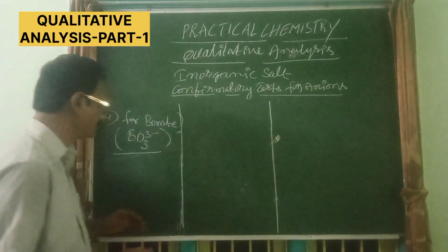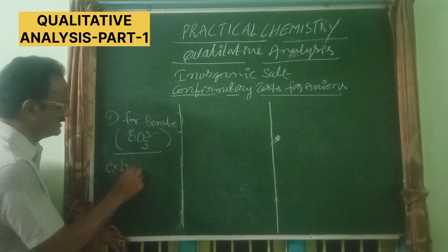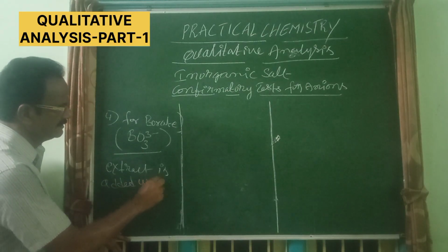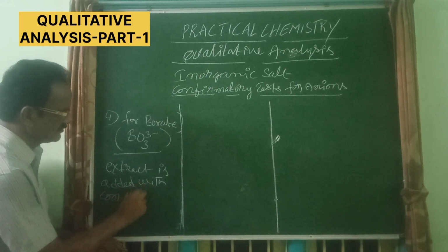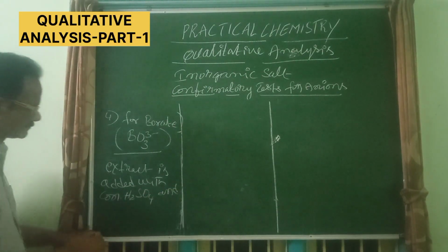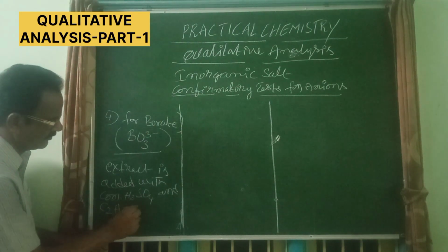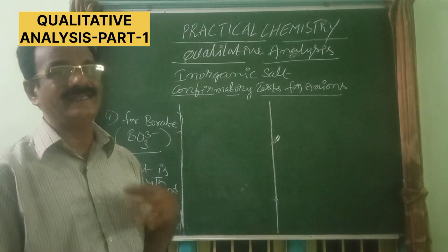Let us see. Extract is added with concentrated H2SO4 and ethyl alcohol, C2H5OH, and then heated.